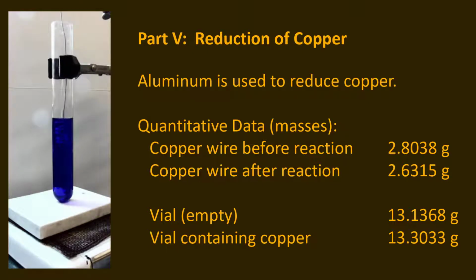So you have this really, really reactive aluminum metal, but it has this really, really unreactive aluminum oxide outer surface that's keeping it from reacting. You add acid to it, of any kind, and maybe you get some bubbles forming, but immediately after that, the aluminum ions will precipitate out with the water to form aluminum hydroxide, kind of as a gel on the surface, and then the reaction stops again.